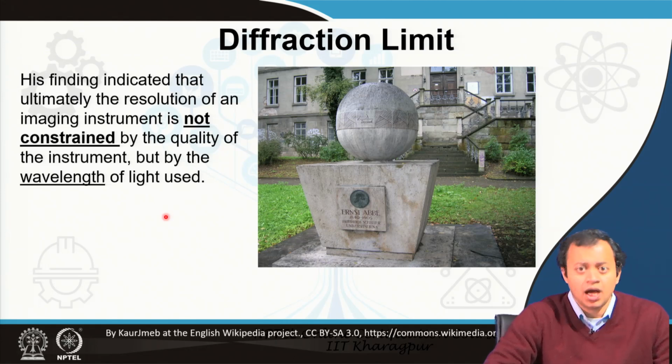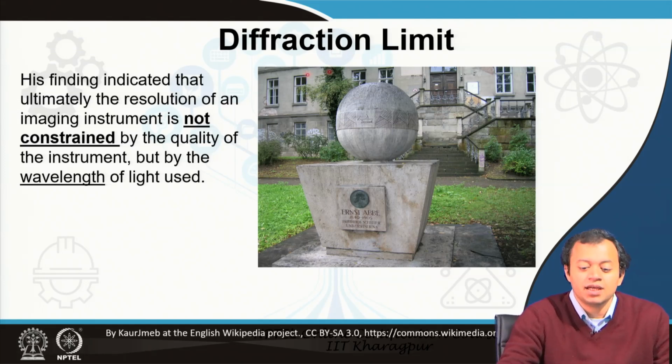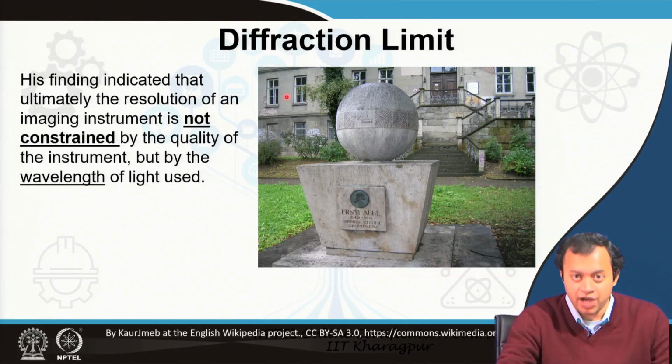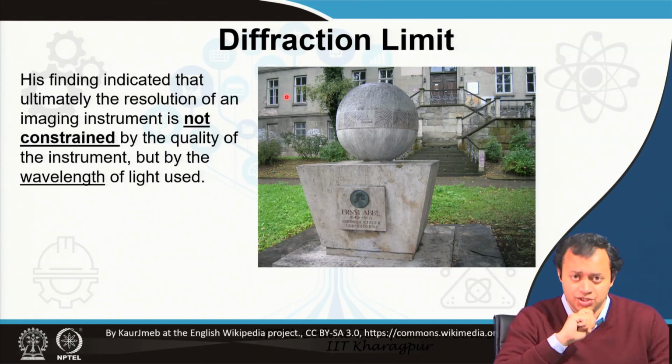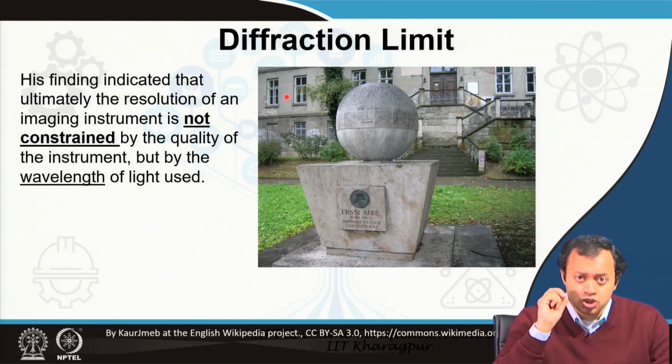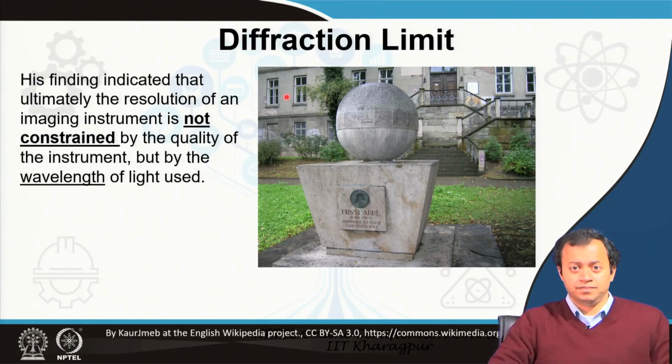It takes just the optical microscopy part and improves it by bypassing the diffraction limit, where we are able to image points, dots, spots which are separated at a distance much less than the wavelength of light. That is what photonics can do.